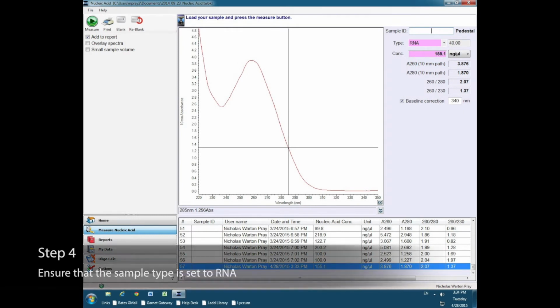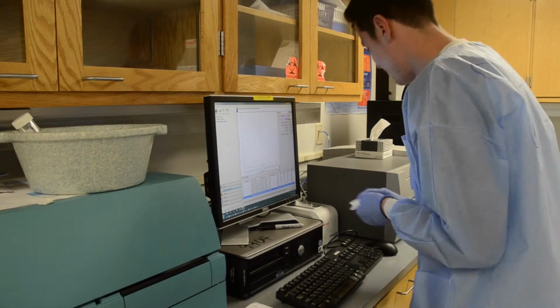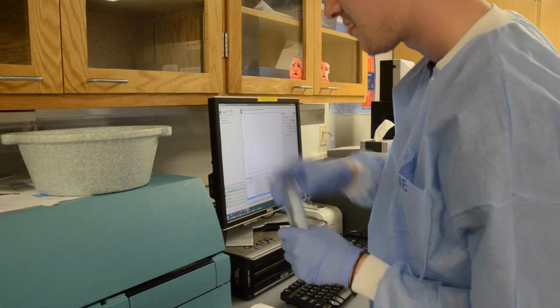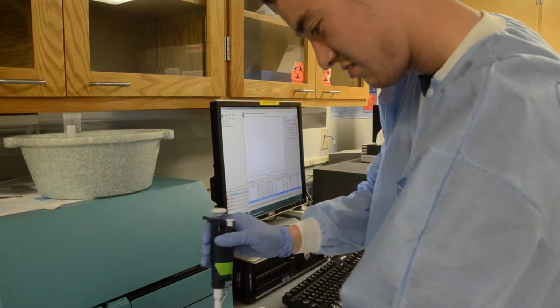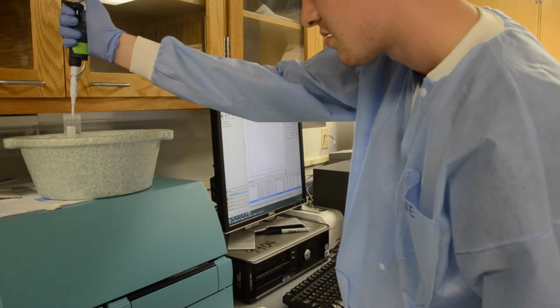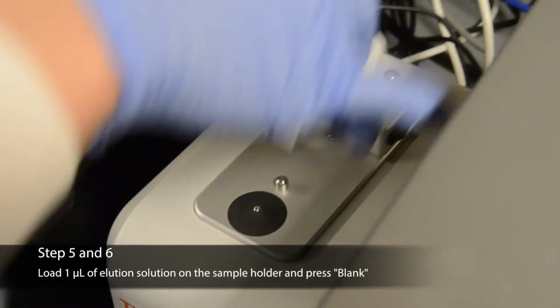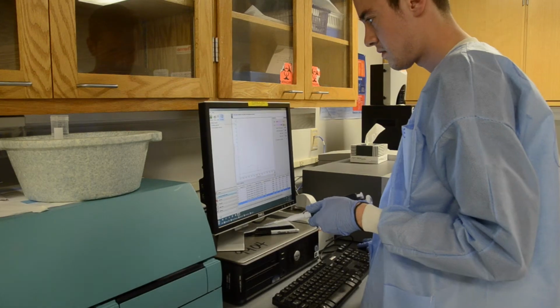When the calibration is done, make sure that the sample type is set to RNA. It will be purple in color. Wipe the upper and lower sides of the sample stage with a Kim wipe to remove any residue. This should be repeated between each sample. Then, load 1 microliter of elution solution on the sample holder and press blank.